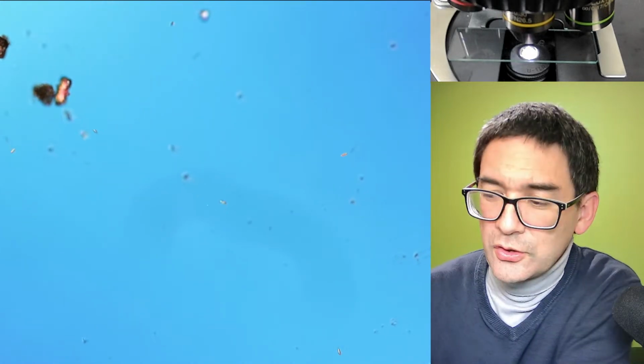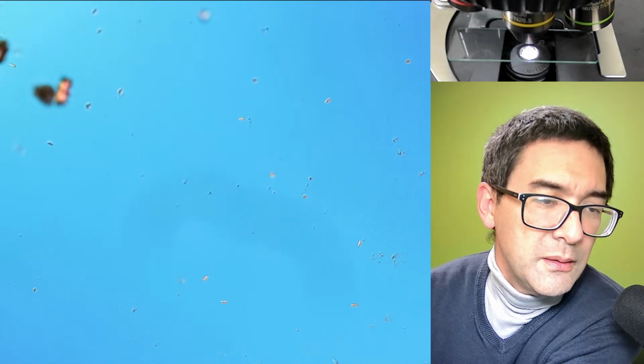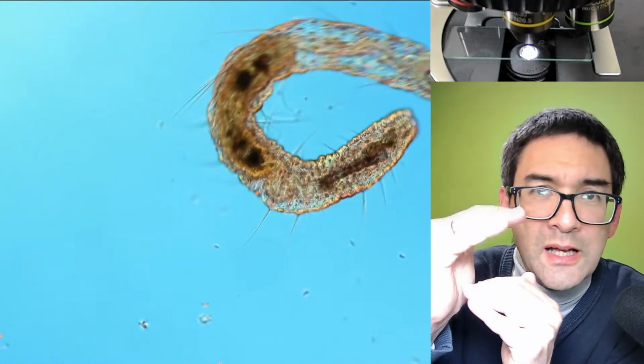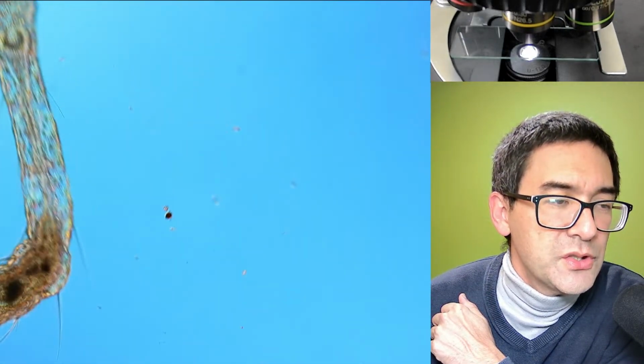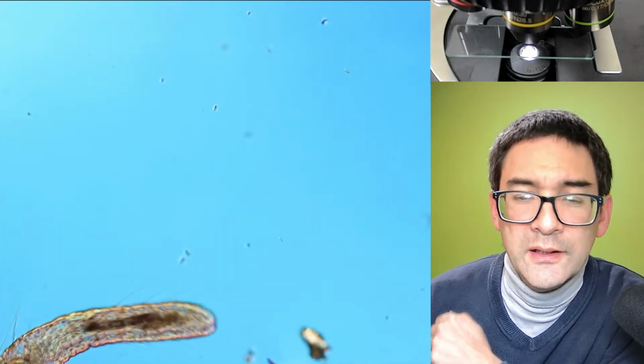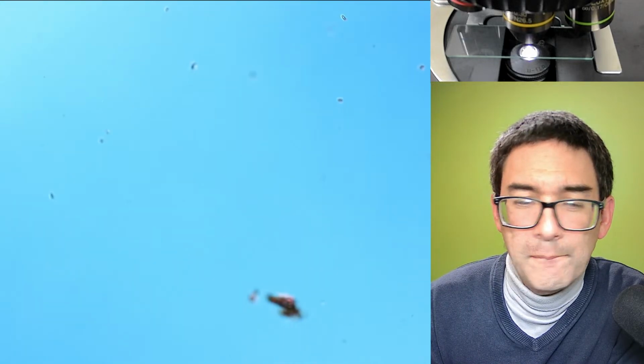Actually, there is no cover glass on here, so that's a little bit easier for me to add the substance. However, with a cover glass, the worm is compressed between the cover glass and the microscope slide, so it's not able to move as quickly, and therefore it's easier to observe. So that's basically Aeolosoma. I'm going to add the substance again. Mm-hmm. I'm just reading. I see that there are a couple of very interesting questions there that I would like to address.